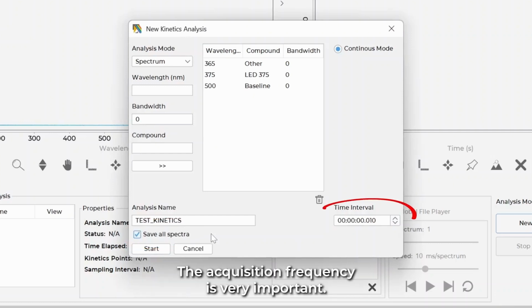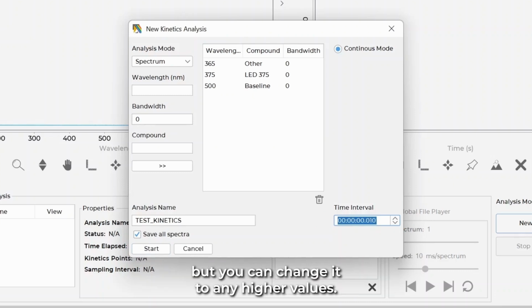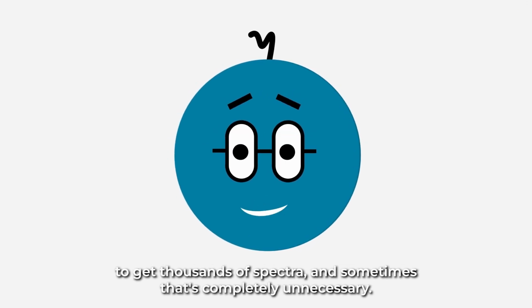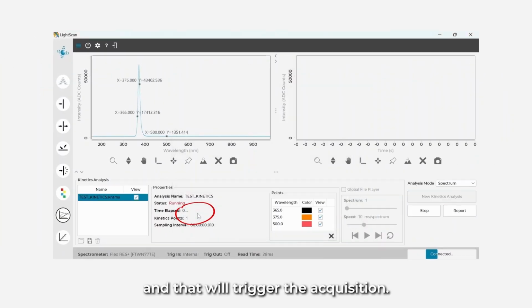The acquisition frequency is very important. The predefined value will correspond to the minimum acquisition time possible, considering the defined acquisition parameters in the Spectrum module. But you can change it to any higher values. Have in mind that with a few milliseconds per spectra, it's really easy to get thousands of spectra, and sometimes that's completely unnecessary. Press Start, and that will trigger the acquisition.